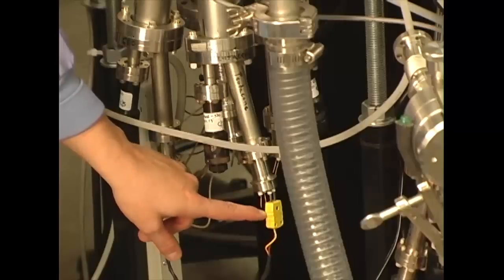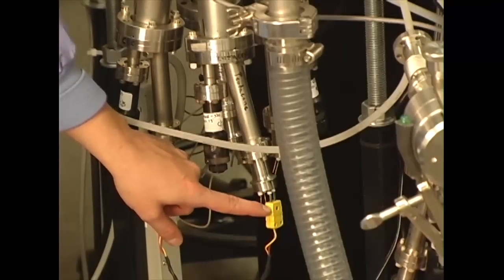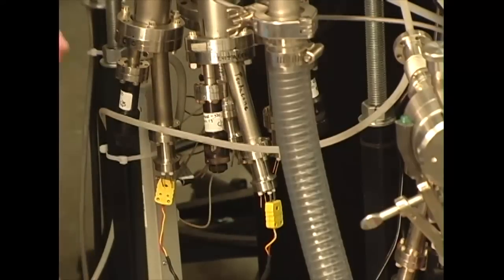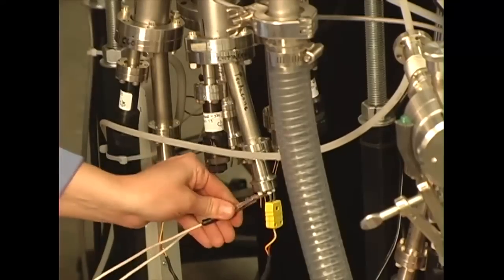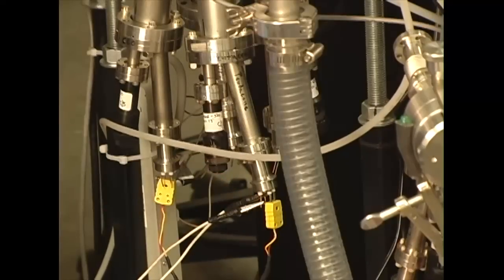These are the organic sources. They have thermocouple temperature control so we can monitor the temperature. We have two current leads so we can control the current and thus the rate of deposition using a quartz crystal monitor.